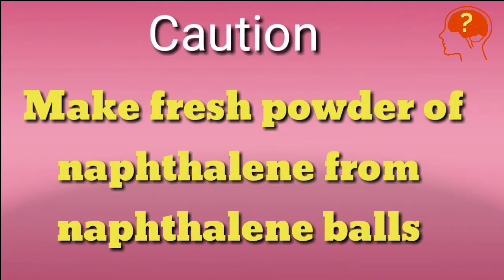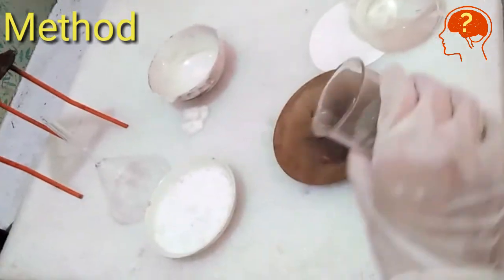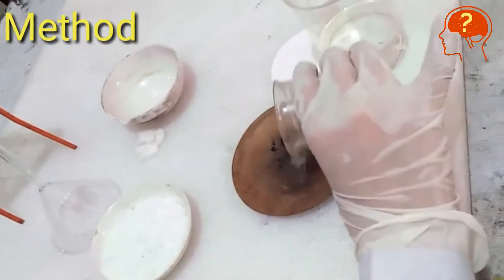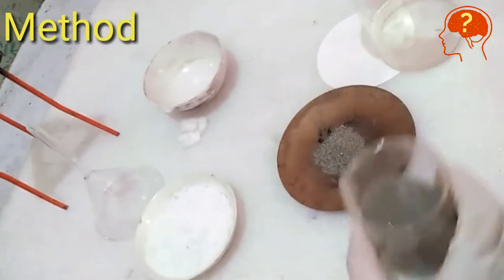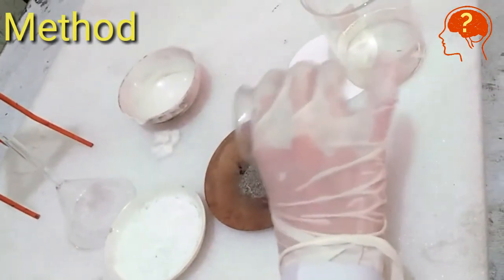Make fresh powder of naphthalene from naphthalene balls, otherwise crystals will not appear. Method: Put some sand into sand bath. One of my students, Mariam, is demonstrating this whole process.